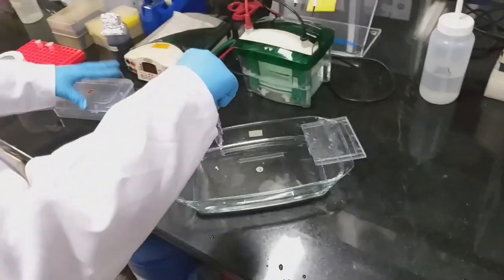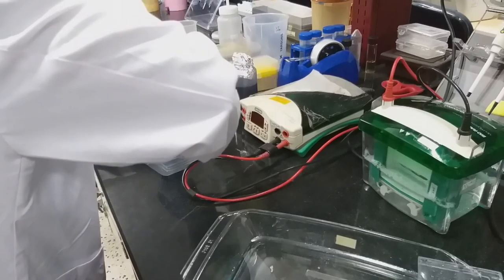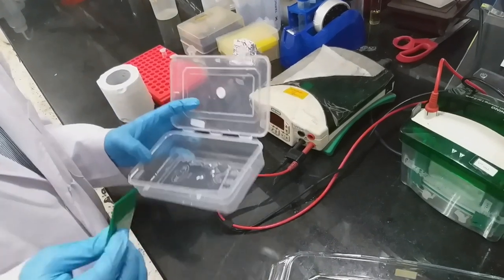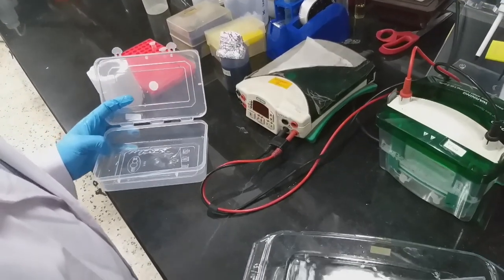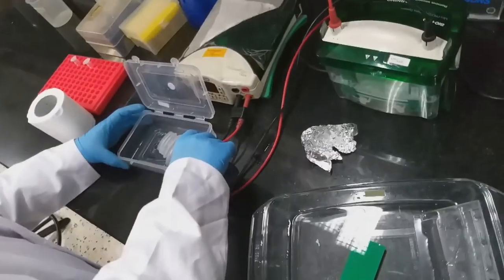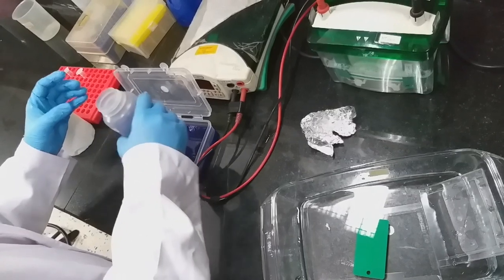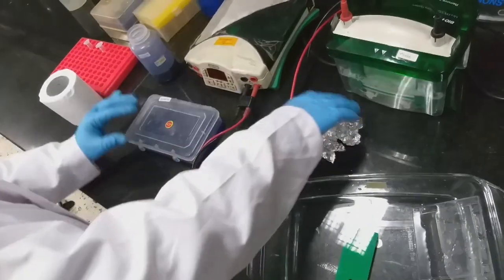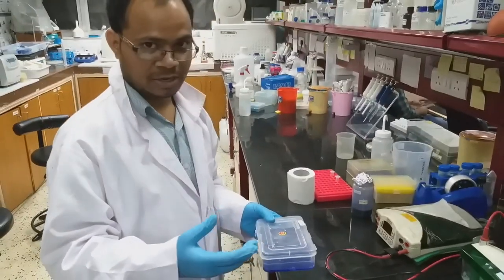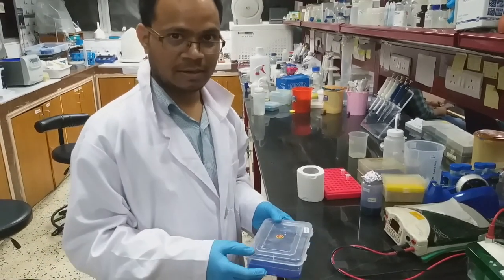We'll keep the gel in a staining box, which is more or less a plastic one, but it can sustain the. So then I'm going to add staining solution. I will keep it for rotation on a shaker for at least 2 hours, then we will de-stain.